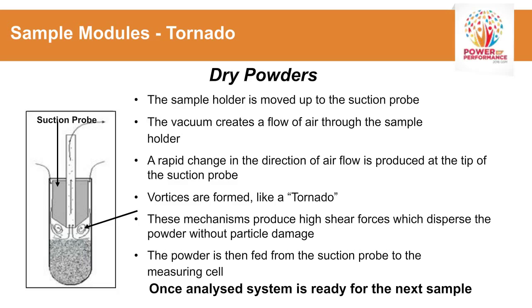For cement, it's not quite as fragile, but in some applications you could have fragile particles that might break if you have too much velocity. And this can happen in pressurized systems where you are forcing the particles under very high pressure. You can tend to break them.